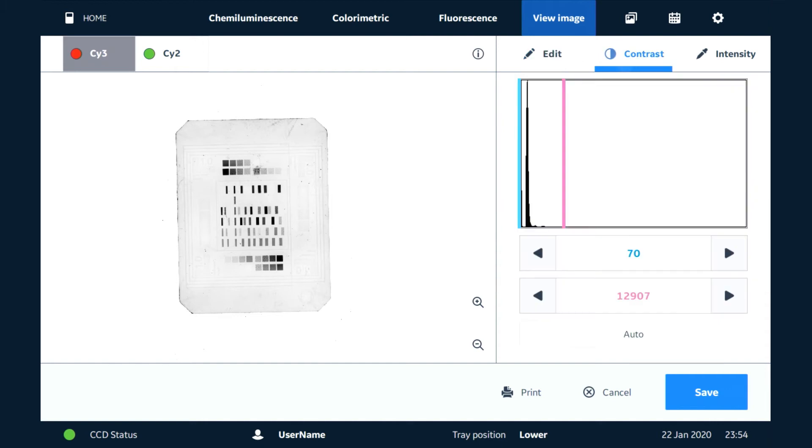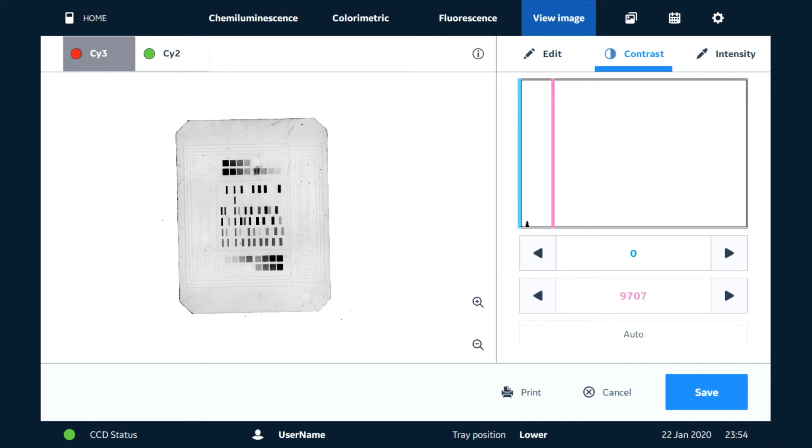We can go to the contrast tool here. Maybe it's going to help us see a little bit more what's going on. We can adjust the contrast using the tool here, which is going around the image histogram. This will affect the JPEG, but it will not change the raw data of the TIFF image.